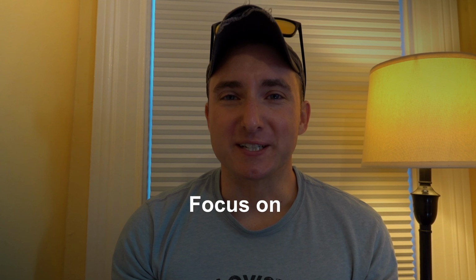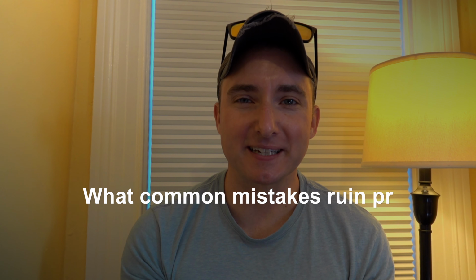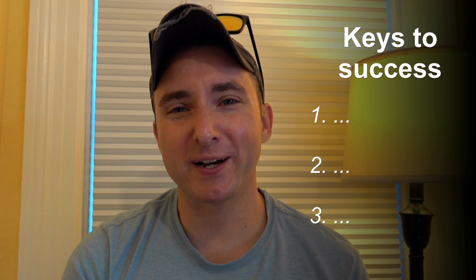My advice is always to focus on the basic techniques that we're using all the time, that are totally indispensable in this kind of lab. If you start at the very beginning and think just about how we extract DNA from the variety of sources of material that we're working with, from blood and hair and tissue, what are the techniques that you really need to get right? And what are the most common mistakes that people make that can ruin a project before it even gets started? Even little minor mistakes that have almost no consequence when you're dealing with a super optimized model system can get amplified when you're dealing with environmental DNA and wildlife, and you might not discover them until it's too late. When I see someone getting these 3 things right, I know right away that they're going to succeed.